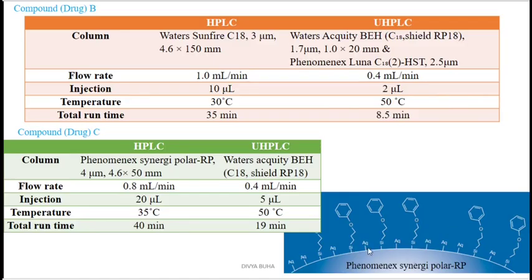And this AQ represents the aqueous form because this type of columns are hydrophilic. So they attract the water molecules, so that's why AQ. Over here again I'm repeating, this is the phenyl group, this is the ether functional group, and then there would be a chain of carbon atoms wherein the carbon at the end would be attached to the silica particles.